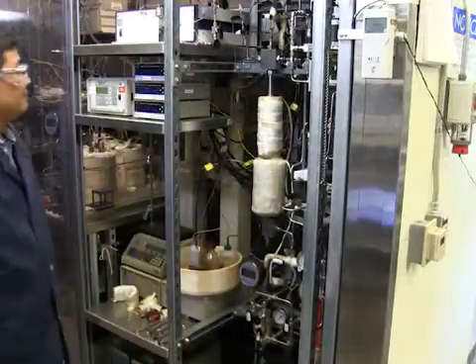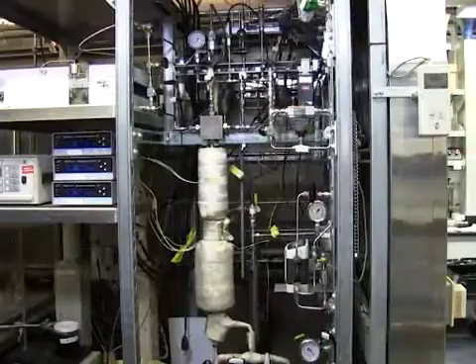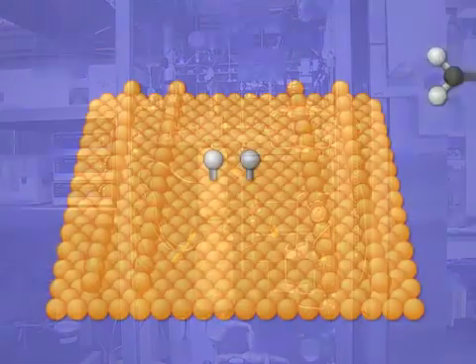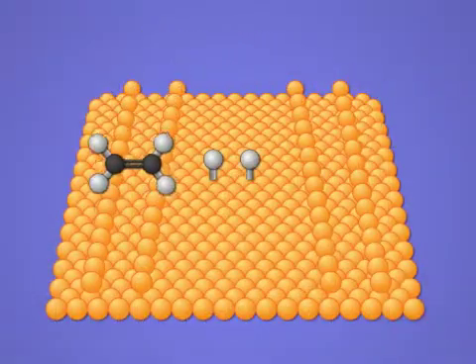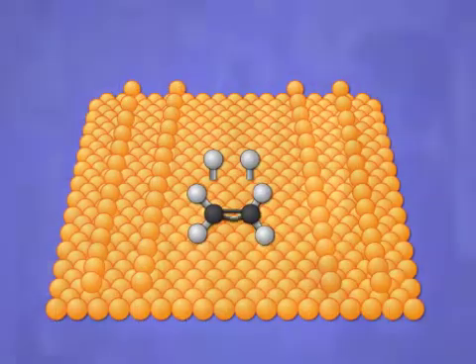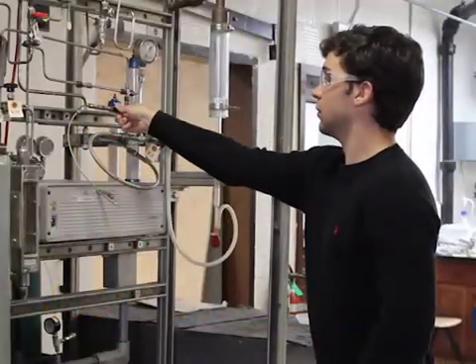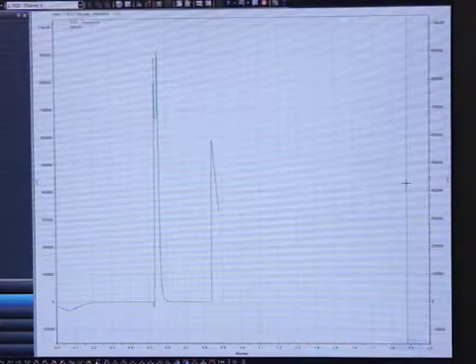Reactors using heterogeneous catalysts are central to several industrial-scale processes, such as the production of hydrocarbon fuels. This video illustrates the principles of heterogeneous catalysts and catalytic reactors, demonstrates a pilot-scale catalyzed ethylene hydrogenation process, and discusses some applications.